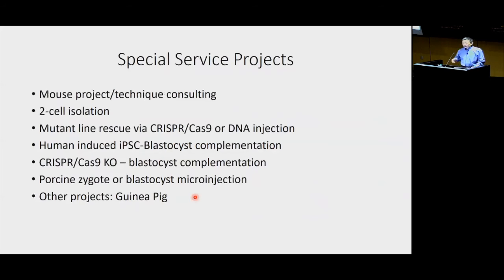We also have a project with some mutations. They want to rescue it, correct the mutations, or make second mutations. So we can do that. That's basically a customized mutant mouse project.